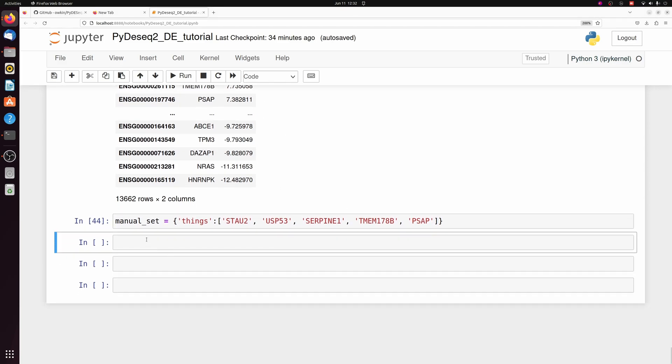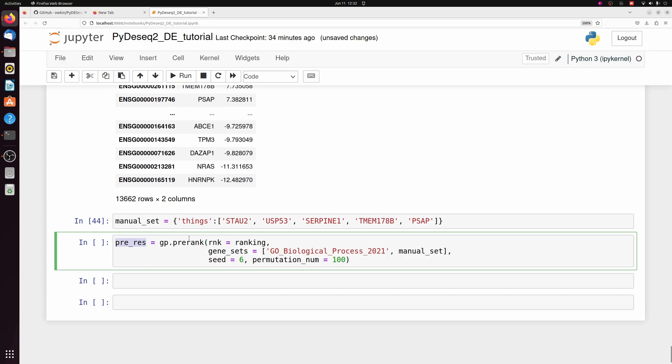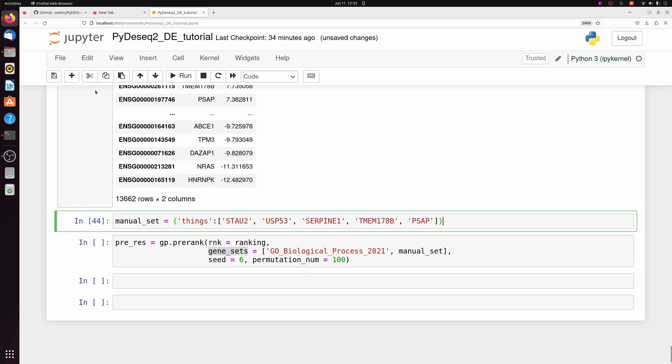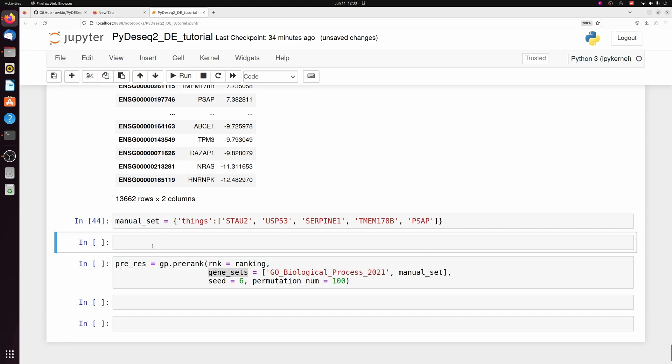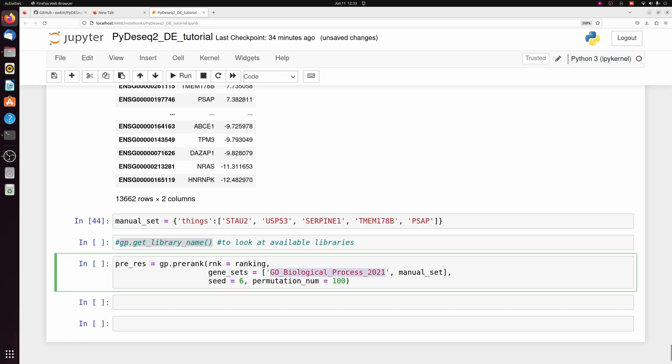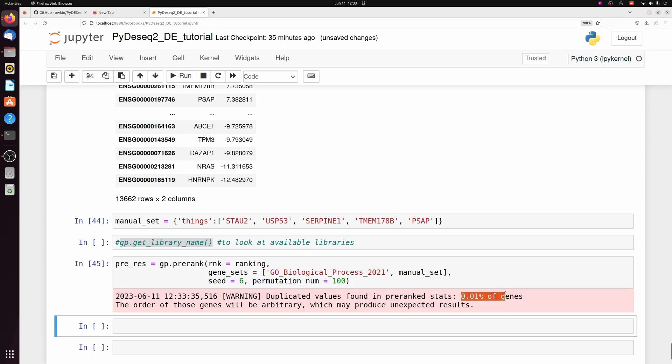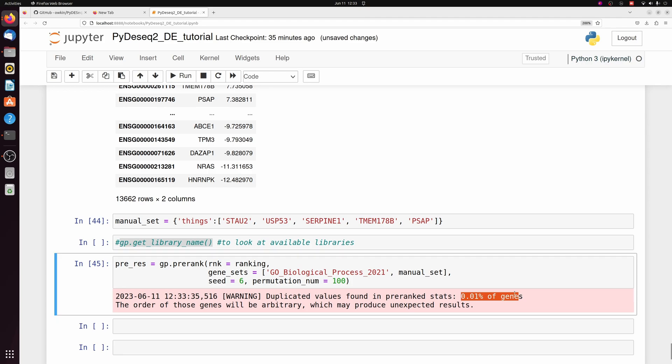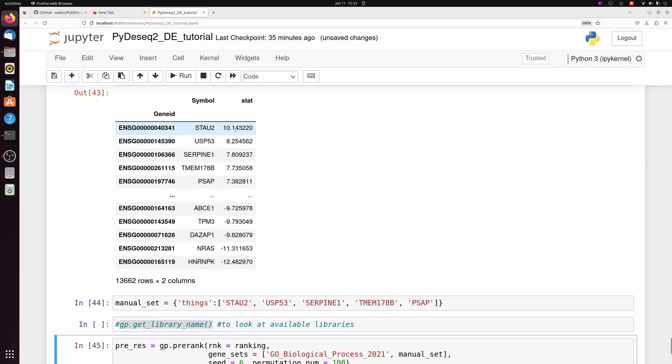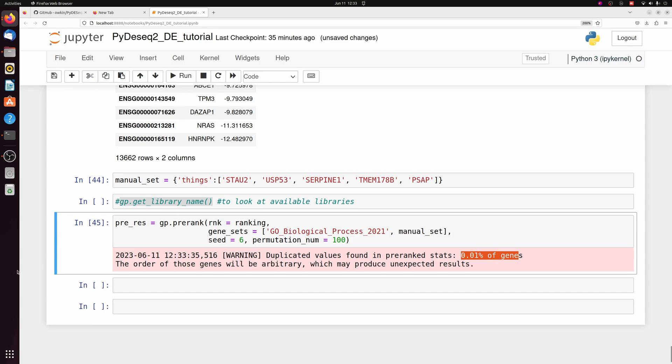And then we'll create our pre-res object with GP pre-rank, passing our ranking. And then for gene sets, if you want to find which gene sets are available, like KEGG and other things, you can look at GP get library names, and it gives you a list. But from that list, I picked GO 2021. And you can also pass your manual set. Don't worry about this too much. You can increase this number, which would theoretically make the analysis more accurate, but it'll take a little longer. This error, don't worry about it. It's just telling me there were a couple stat values that were equal.